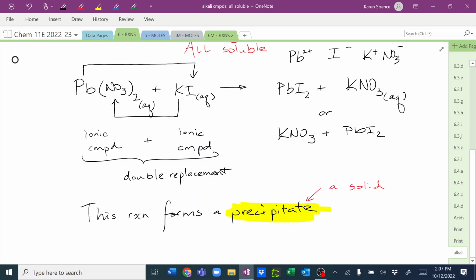Now, you are gonna get a chance to use this later this year, okay? And we're going to just turn this on right now. What time did I turn it on to? Oh, hang on, we have a problem. Why are you vibrating? Ah, I know exactly why it's vibrating. I did not balance it, silly me. I should know better.